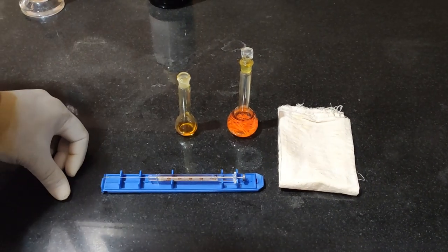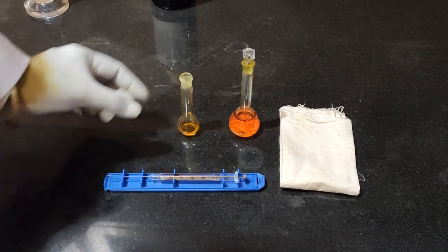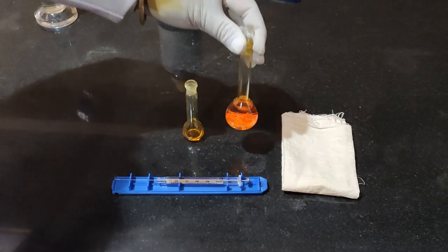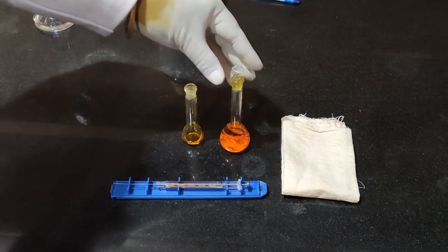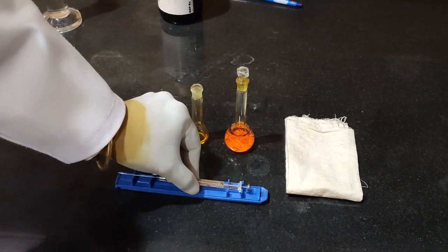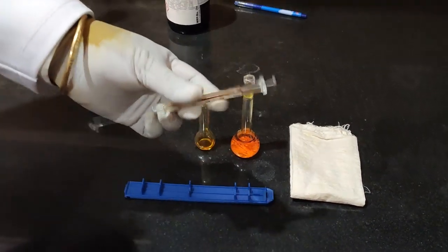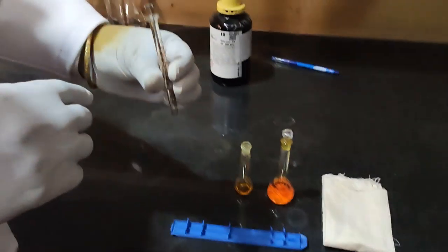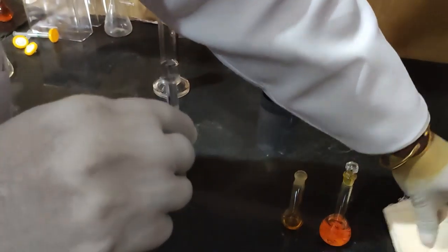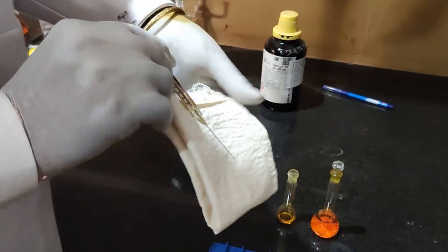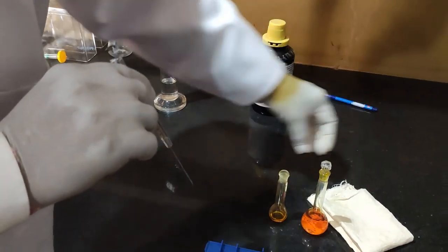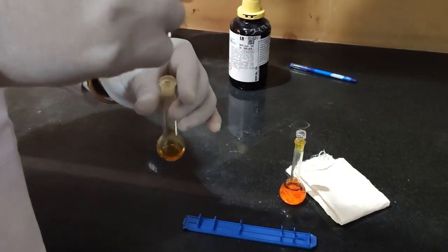Sample is carefully taken in special syringe and always check it for air bubble. Wipe the syringe with tissue paper and fix the syringe in sample injector.